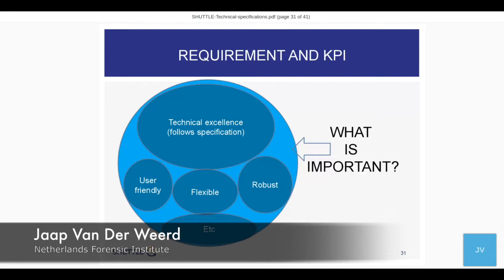But other things that are important is robustness. We want Shuttle to be a toolkit that will be an international forensic standard. That's quite high in aim, but that's what we intend. We want a new international standard for trace investigation. So if we have a machine that breaks down every minute, needs supplier intervention once a week, it will never be a system. So robustness is an issue.